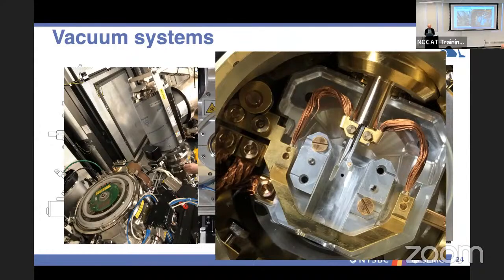That's actually the optical axis of the electron microscope. The main optical axis of the electron microscope is actually very small. And the main width of the column is the electromagnetic lenses as well as the lead shielding. And then only when you get to the octagon, as you see on the far right, is where you have the sample and the cryo box. And so this is what it looks like in a Krios system.